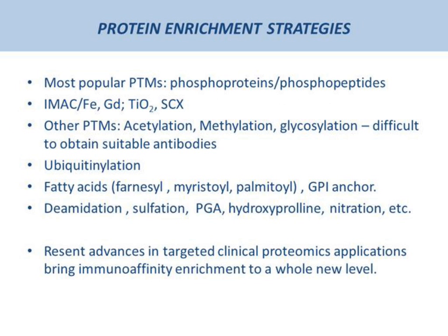Phosphorylation, for example, is the most popular post-translational modification in proteomics due to its role in signal transduction. Current methods to enrich samples for phosphorylated proteins are based on affinity purification using phosphospecific antibodies, immobilized metal affinity chromatography, in short IMAC, strong cation exchange chromatography, or titanium dioxide chromatography. Anti-phosphotyrosine antibodies have been proven very successful in purification of phosphorylated proteins and peptides, but fewer reports have been published that successfully used antibodies against phosphoserine or phosphothreonine-containing proteins, since the affinities for those phosphorylated amino acids differ. Antibody-based peptide enrichment is considered inferior to other methods at the moment.